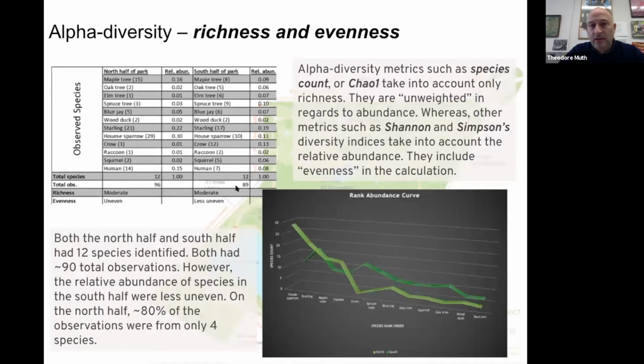The other thing that I wanted to point out about the alpha diversity plots is that in the case that you get from the Nephele output, for the alpha div file, you have Chao1, which is just a measurement of richness. Oftentimes you can also see a species count or observation counts. That's just counting the number of different species that you saw. And so it's just looking at what we call richness. Other metrics like the Shannon's diversity or Simpson's diversity look at evenness as well.